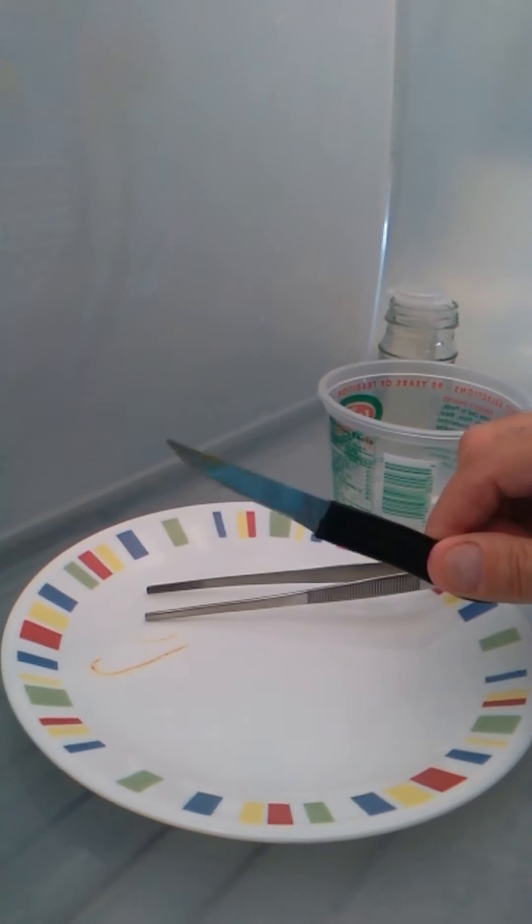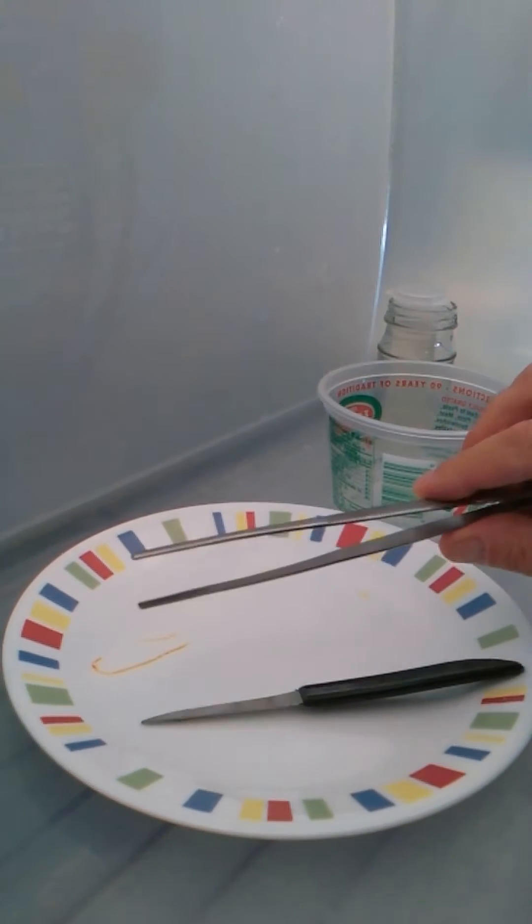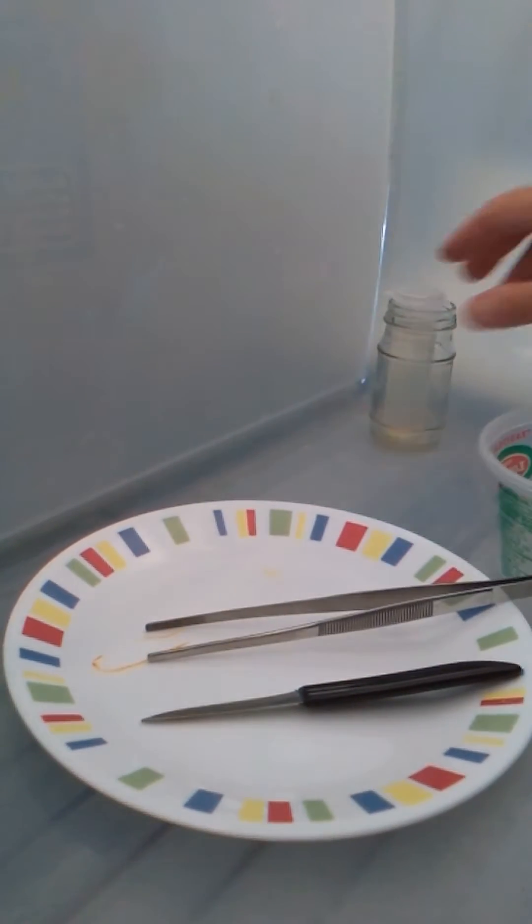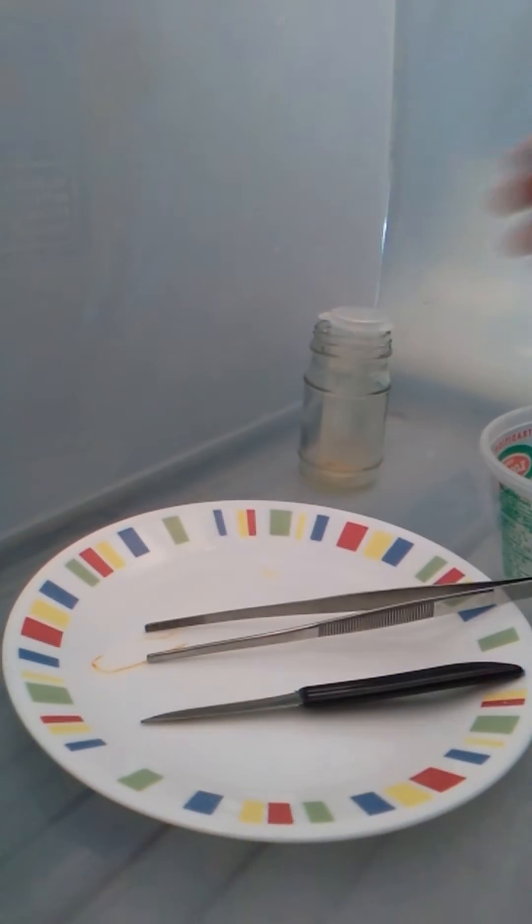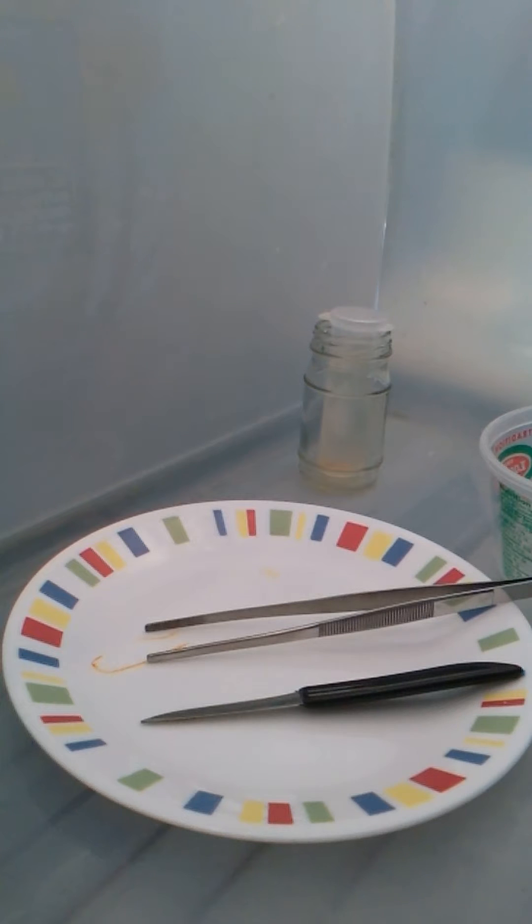I've got paring knives which are going to be my scalpel, forceps, my cleaning plate, my jar of alcohol, and my spray bottle of alcohol for cleaning the plate and everything.